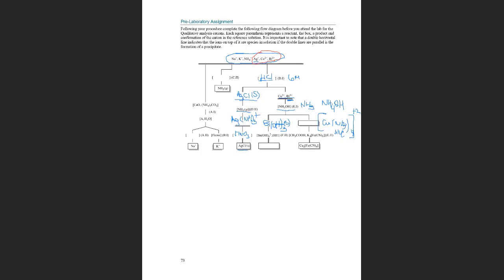So this is just a little summary. And then we need two confirmatory tests, right? When we add sodium stannite to the white precipitate, we obtain a black solid, bismuth. And what happens when we add hexacyanoferrate to the blue? We obtain this red brown. So these are all signals that in our sample we had copper.